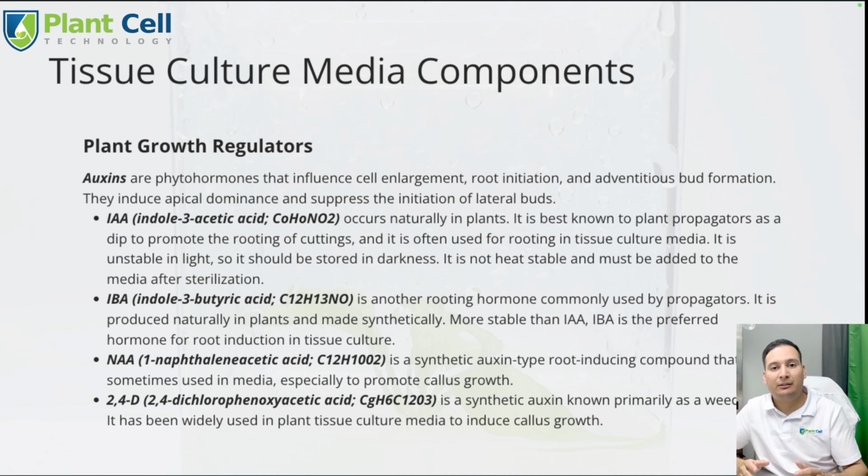conditions. So if you don't have a laminar flow hood, I would avoid using IAA, and in general most natural hormones, because they're usually not heat stable. Usually synthetic hormones are the ones that are heat stable, and those are the ones I like to use the most, because I don't have to add them after I sterilize the media. I can add them directly when I'm making my own media.